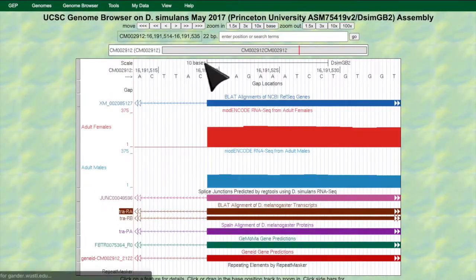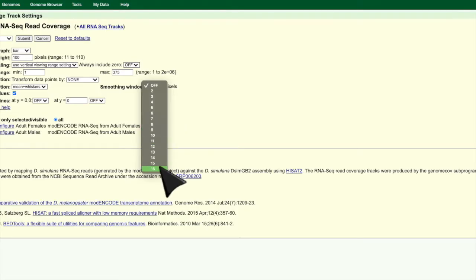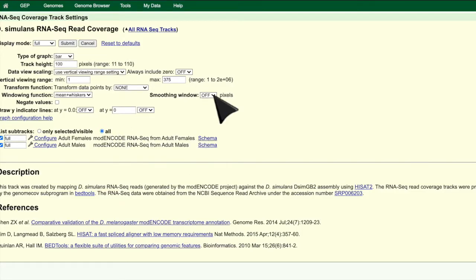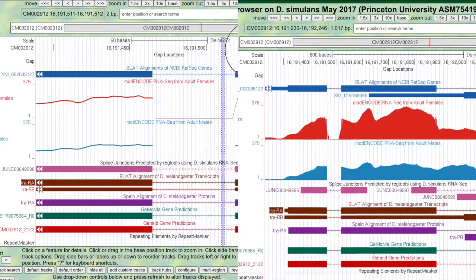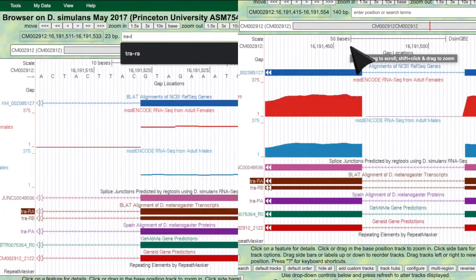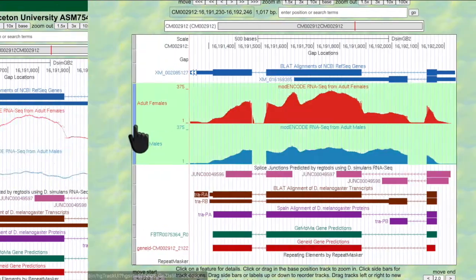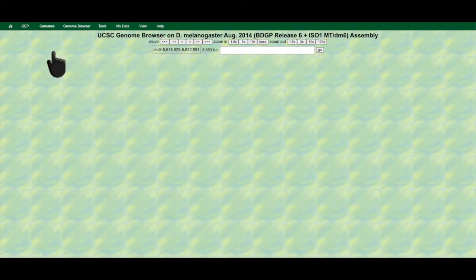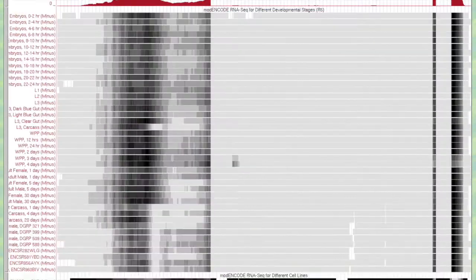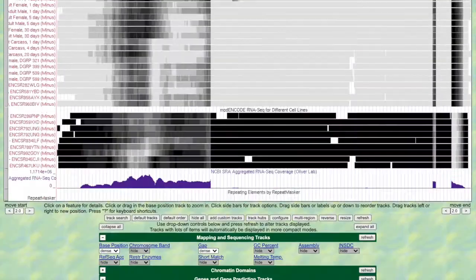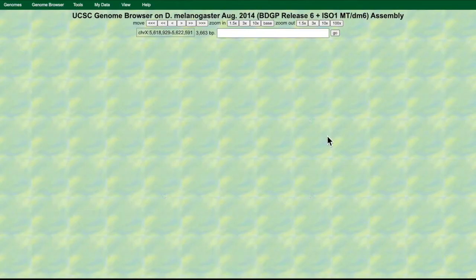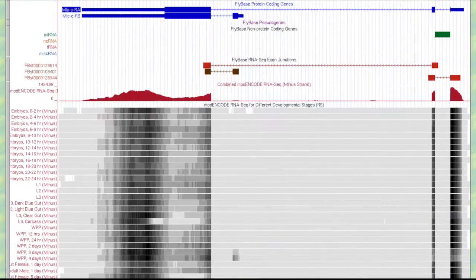When the smoothing window is on, it ought to give you a more accurate but less precise picture of how the reads aligned, which can be useful when working with low resolution RNA-seq data. And if you ever notice that your RNA-seq reads are expressed exactly where they should not be and lacking where they should be — in other words, they look inverted — you may need to negate the values. It's a simple but handy fix to know.